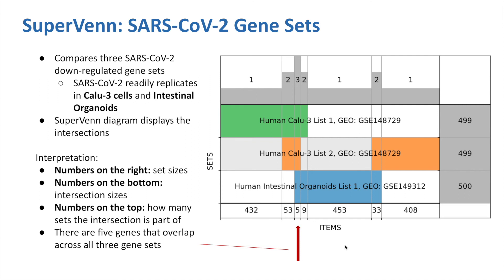To interpret this, we see that the numbers on the right display the size of each set, the numbers on the bottom display the size of each intersection, and the numbers on top display how many sets the intersection is part of. The red arrow shows where all three sets are lined up, indicating that there are five genes that overlap among all three sets. If we examine these genes, we can see which genes overlap among all the sets, and this could be interesting to further look into so we can better understand how the virus works.